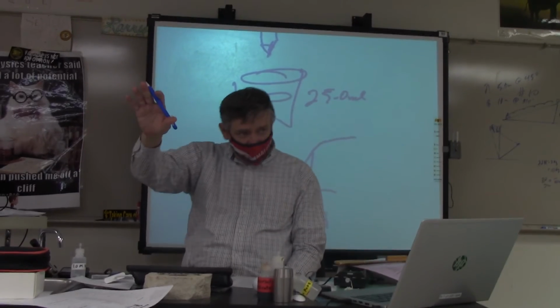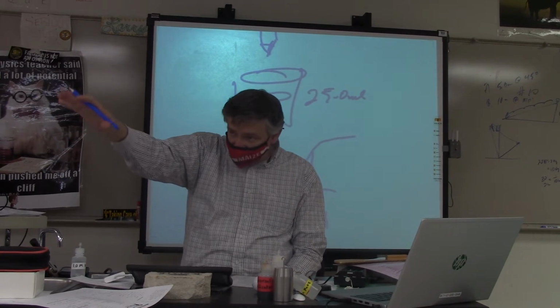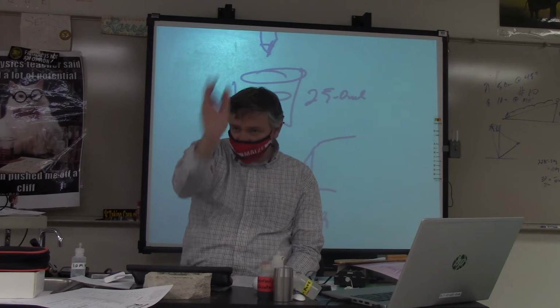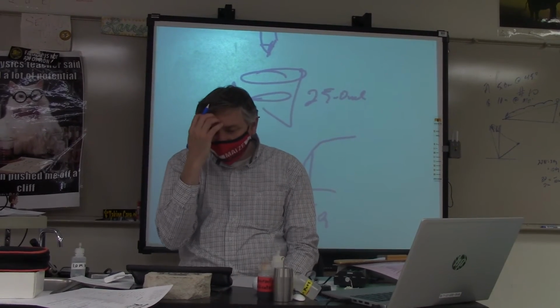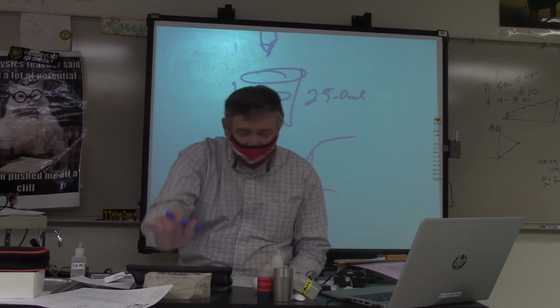So on this test that's going to be coming up, that's what I'm going to expect you to be able to do. If I gave you this graph, so okay, here's my equivalence point, here's half the equivalence point, I use that to get my pKa value. Okay, you don't have to, but I'm just telling you, that's what you have to be able to do, right?